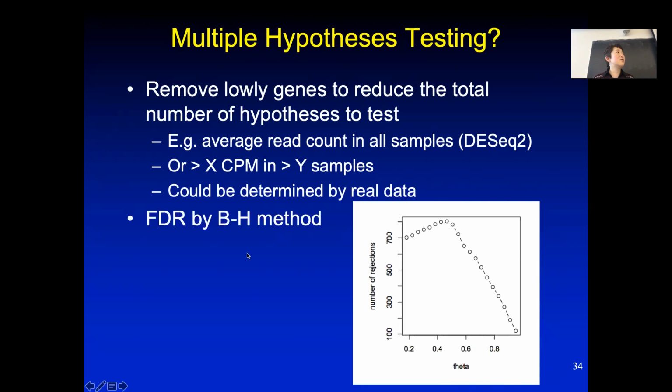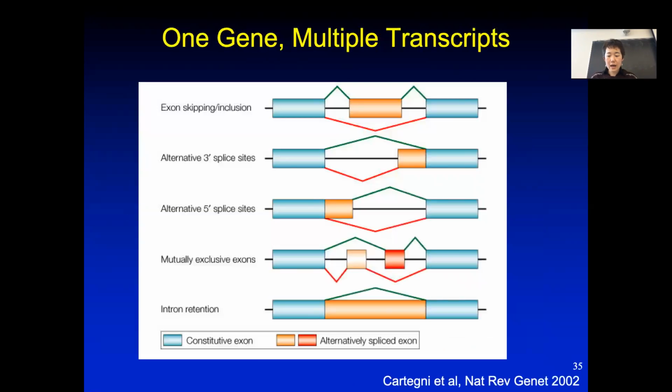And so at the end, you use Benjamini-Hochberg, at least for DESeq, for FDR correction, okay? For the remaining little time, we will not have time to really go over this algorithm, but at least we want to show you that you can potentially use it.